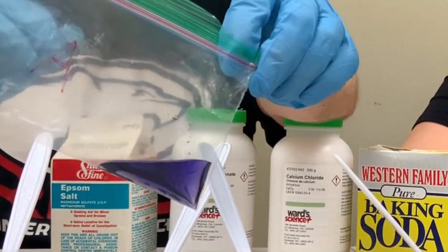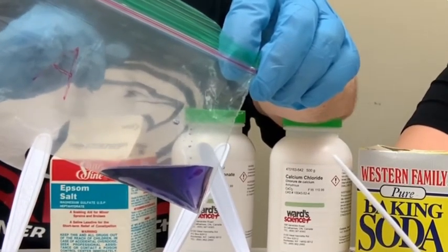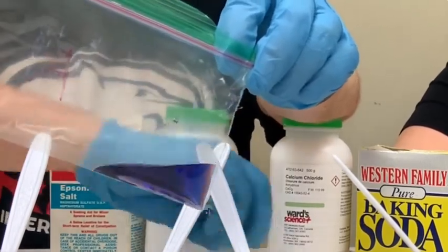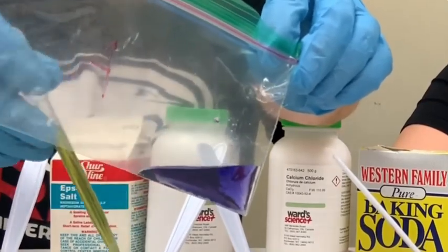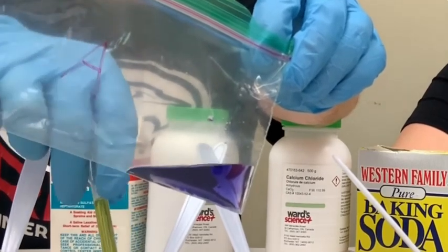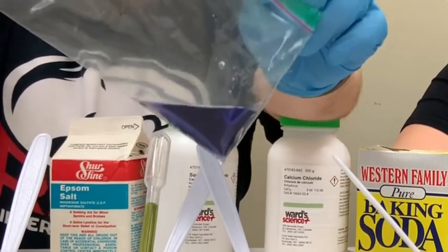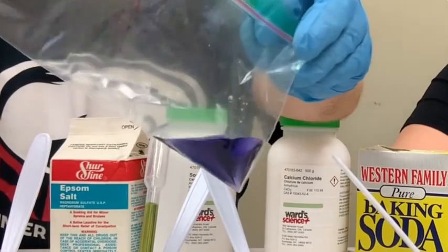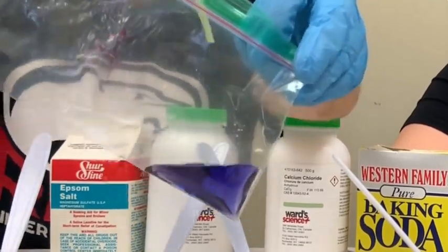What was the next one? And then we're going to use the pipette to add 3 droppers of sodium carbonate to bag A. Sodium carbonate, and that was the second one here. So just like the last one, we're going to be looking for color change, temperature change, if a gas is produced, if there's a precipitate, meaning something formed at the bottom, or a solid formed. It doesn't necessarily have to be at the bottom. So we're going to put in 3 of these here. So we have this purple. We're going to add this yellow.